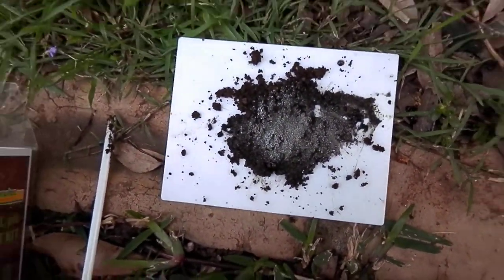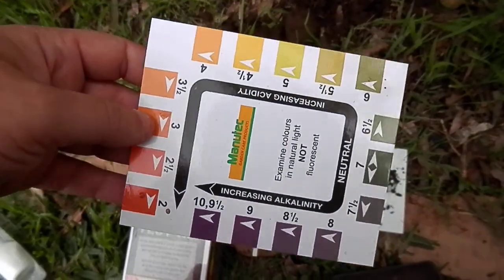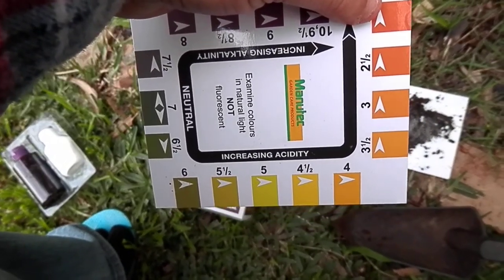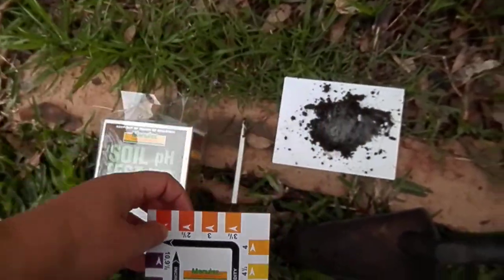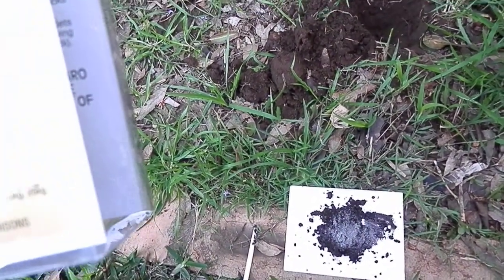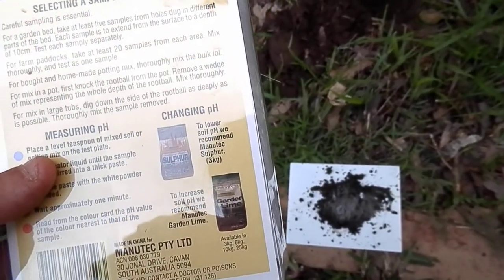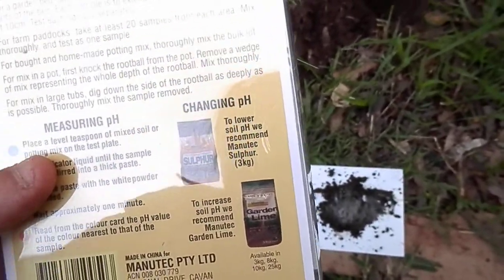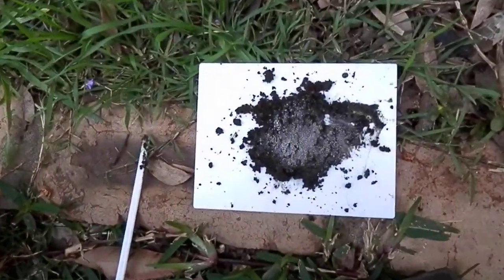So if it was more purple, it would be increasing to alkalinity. And if it was more yellow to orange, then it would be increasing acidity. If it gets too alkaline, you're supposed to fix it up with sulphur. And if it's too acidic, you add some lime to it.